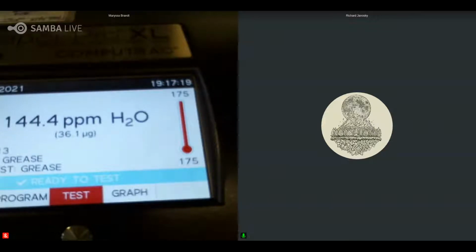And the thing that we enjoy is that, as Marissa mentioned, we first set a time. Our sample has a minimum time that it has to run for. Part of our study at the beginning, when we started using this, was looking at the ending rate and finding the right ending rate for the material that you're testing. And when we did our comparison, we did get very similar data to the Karl Fischer when we did our internal testing with the units. That's something that we could share with you. We just don't have it right now to share.